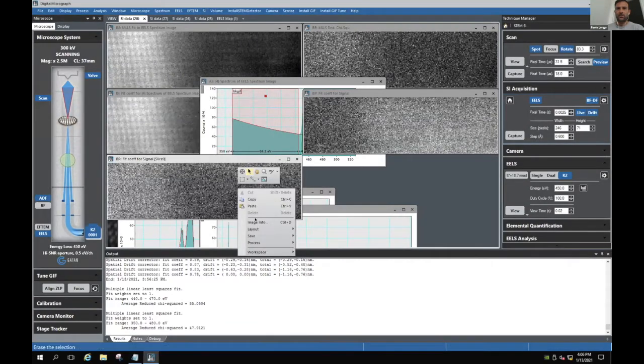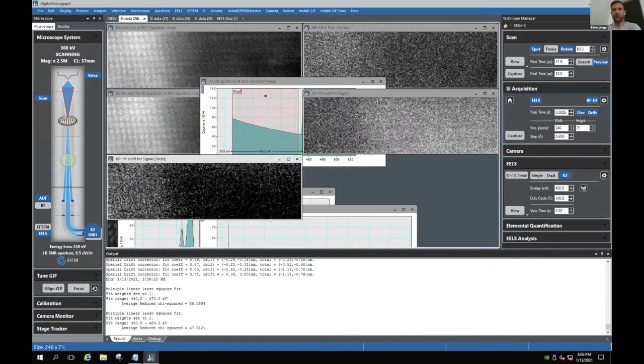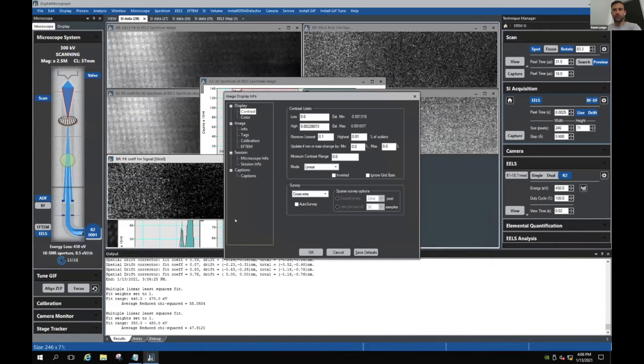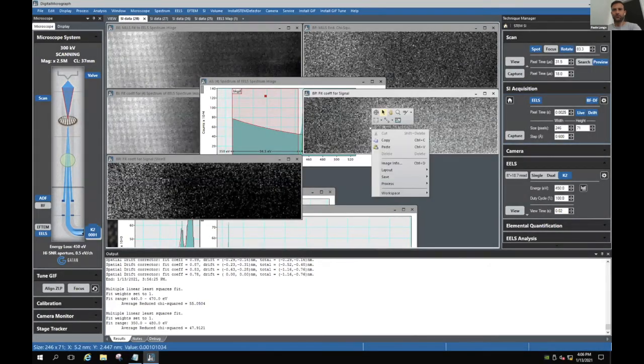So to make your map a little bit better, we can remove the negative components, the negative counts. I like to go on crosswire, it literally boosts the contrast. Let's make sure that this is good. And we do the same thing there.